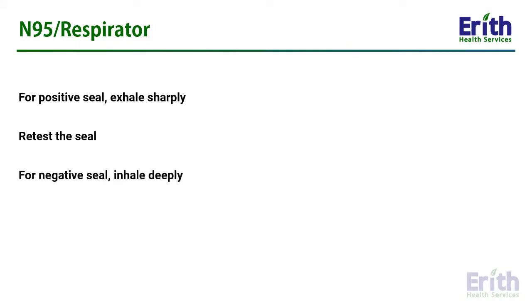To check for negative seal, inhale deeply. If no leakage, negative pressure will make the respirator cling to your face. Leakage will result in less or negative pressure in the respirator due to air entering.